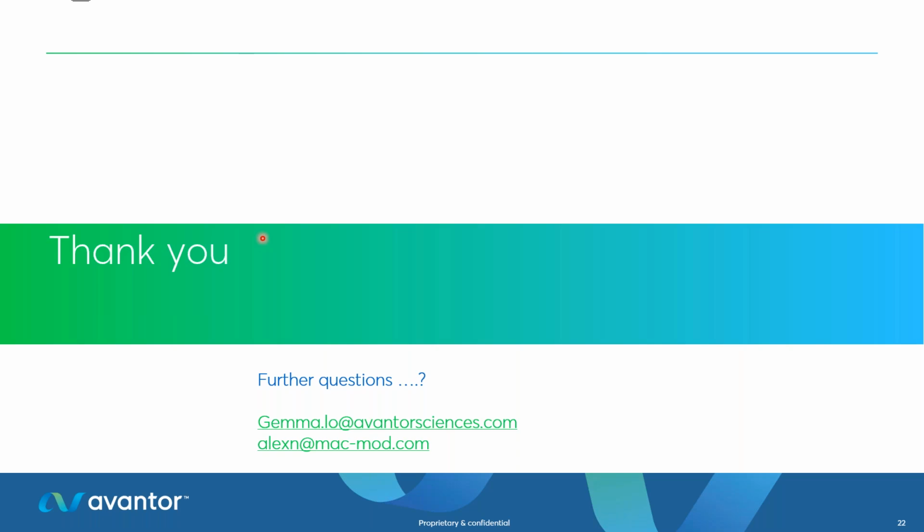Okay, are there any other ways to change selectivity dramatically? You could change the mode of chromatography. So I've focused really today on reverse phase, but of course you could shift completely over to, I was going to say normal phase, but really more people are moving to HILIC, hydrophilic liquid chromatography. That would give you a real shift in elution order, in retention and selectivity.